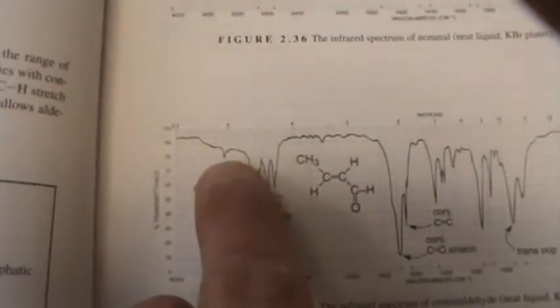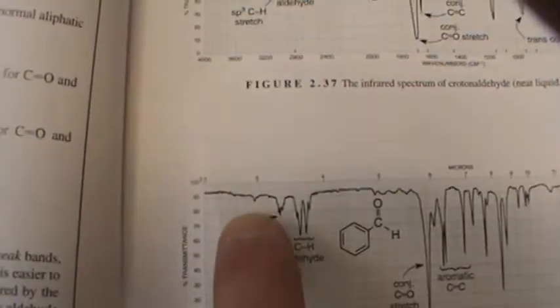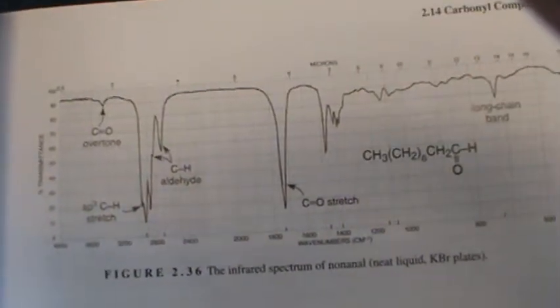And you can see here they didn't label it, but the little spike is there. Little spike is still there. So when you see it, you kind of know it and you can circle it. So let's look at ours.